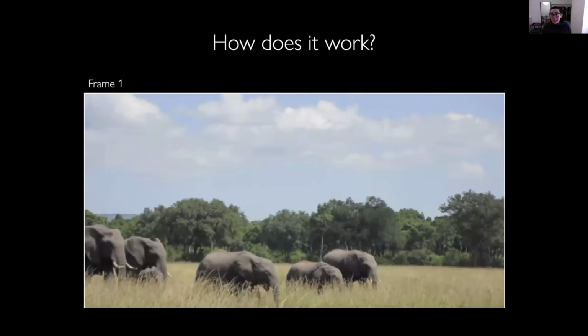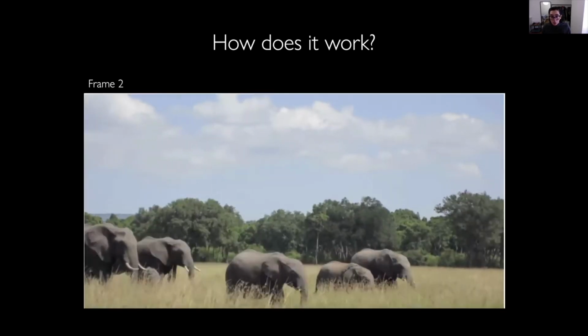So first of all, we need a movie. For my elephants here, I have a really, really short movie. It's just 2 frames, and I'm going back and forth between these 2 frames, and you see our elephants moving in the savannah. So I have an object that's moving.